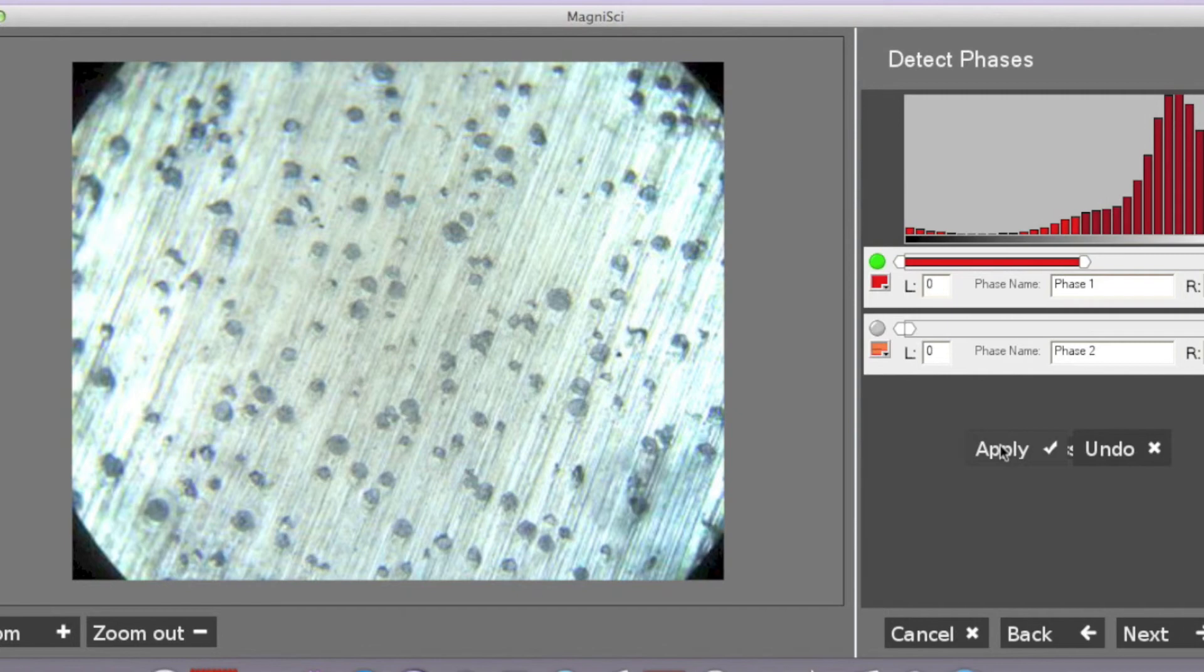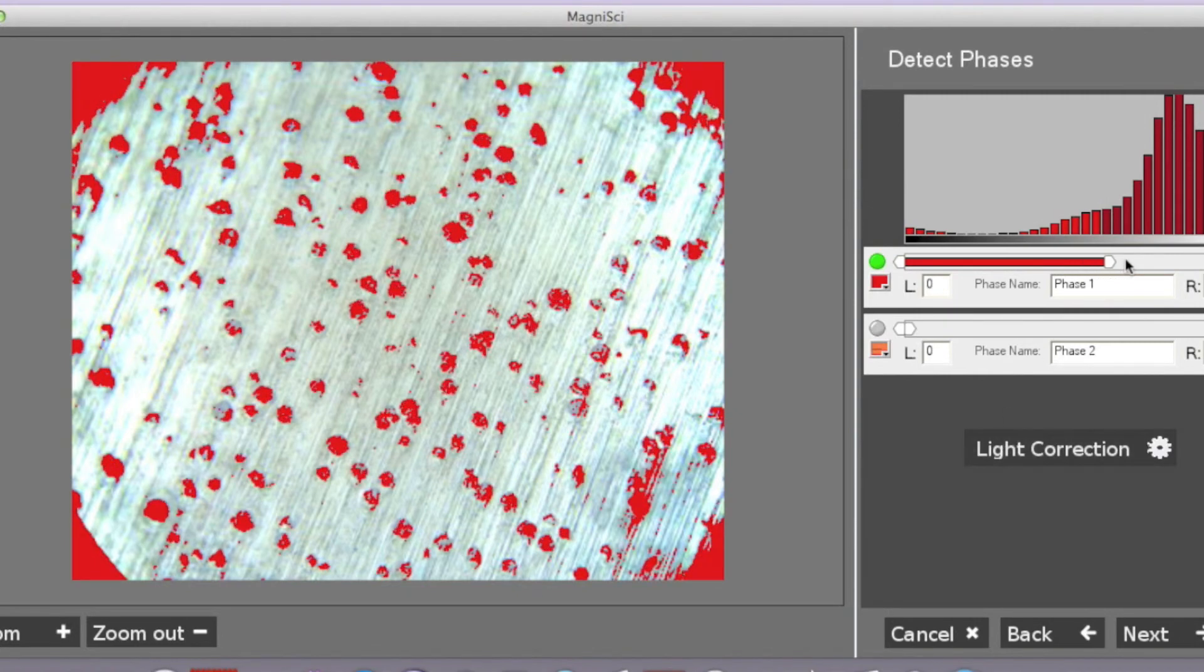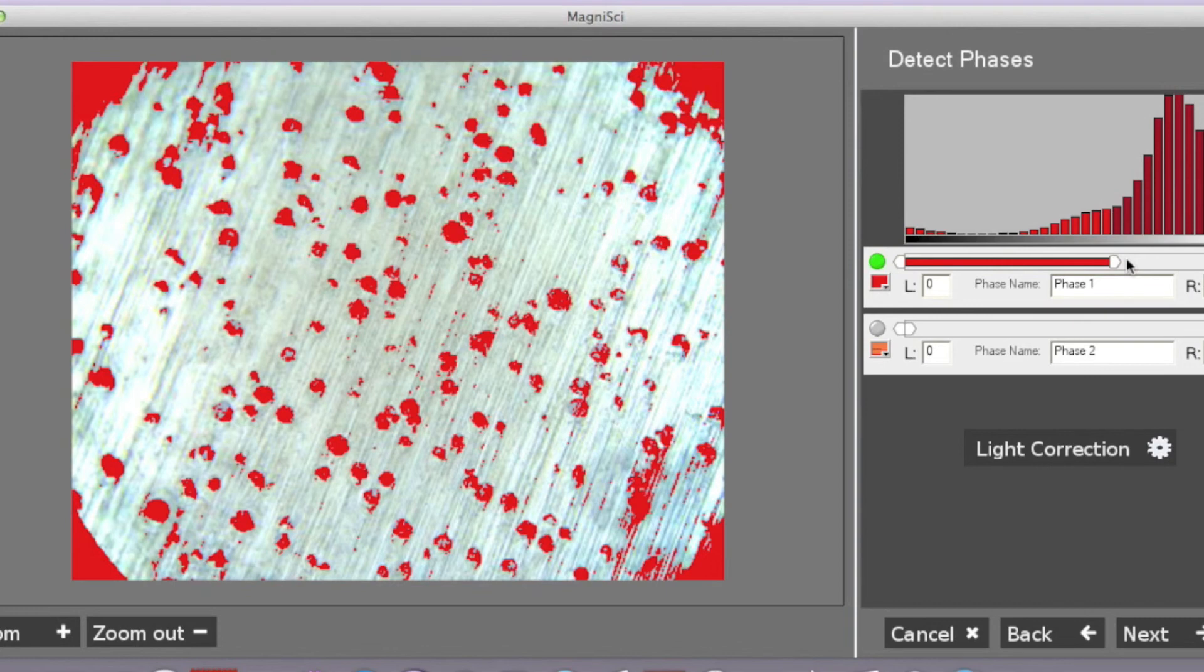We apply the changes. And as we can now see, selecting the area is a lot more accurate.